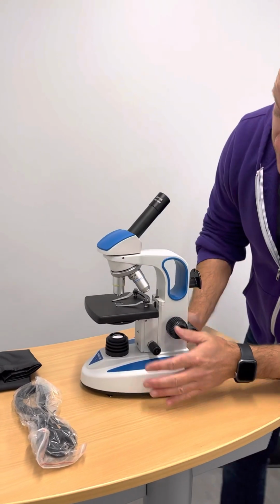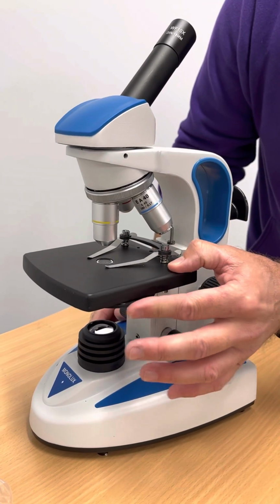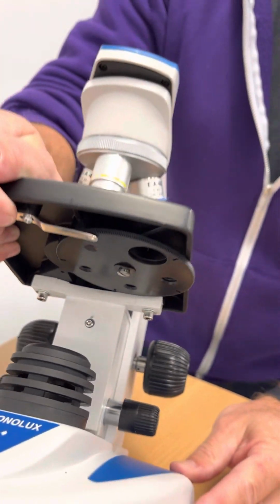Okay, so what's on the side? Here, diaphragm. Hear that? You can hear it all clicking into place. That changes holes along the bottom to allow different amounts of light in through your specimen.